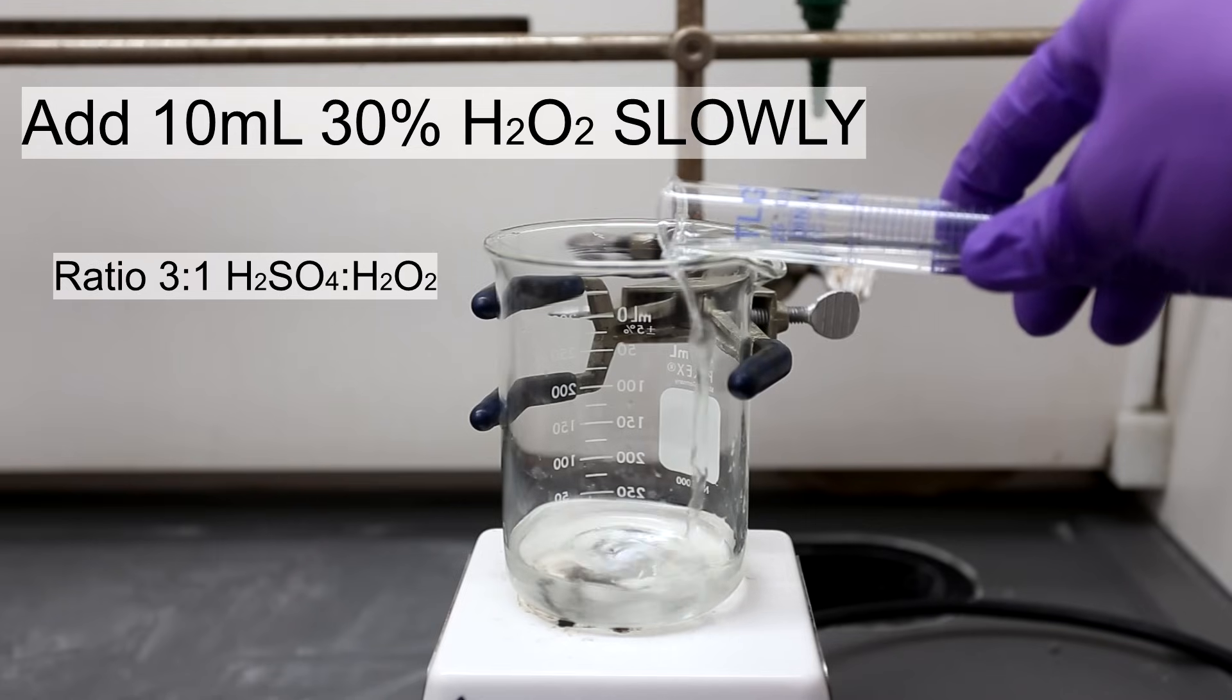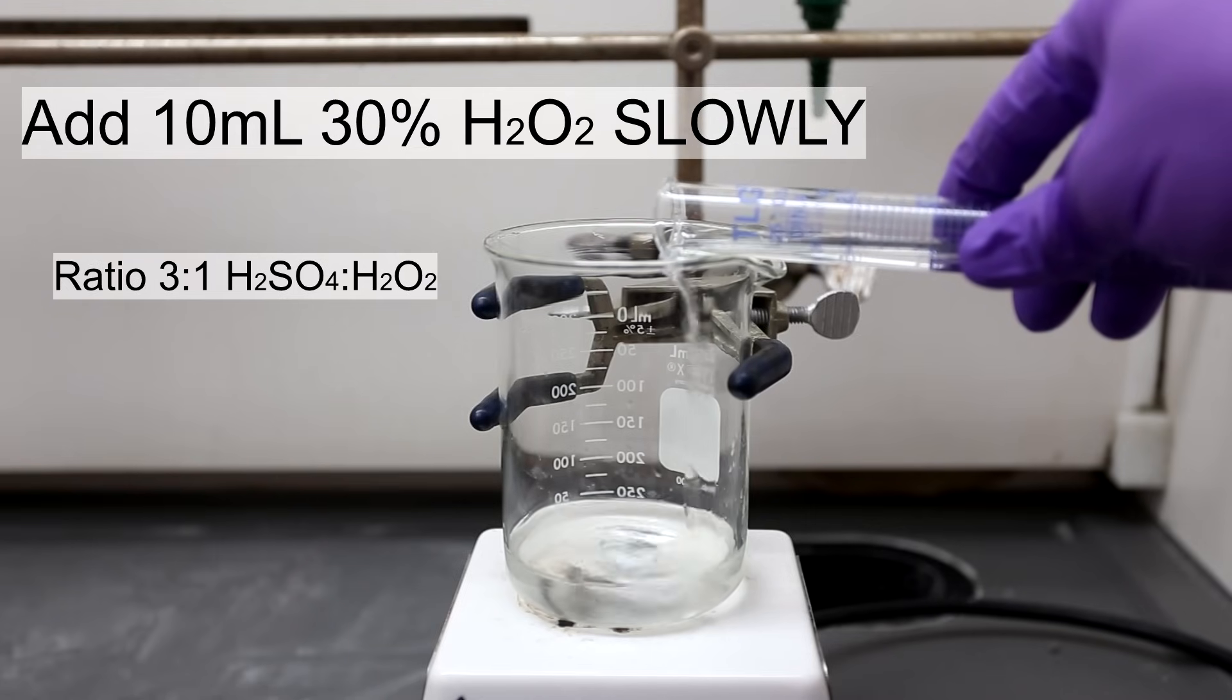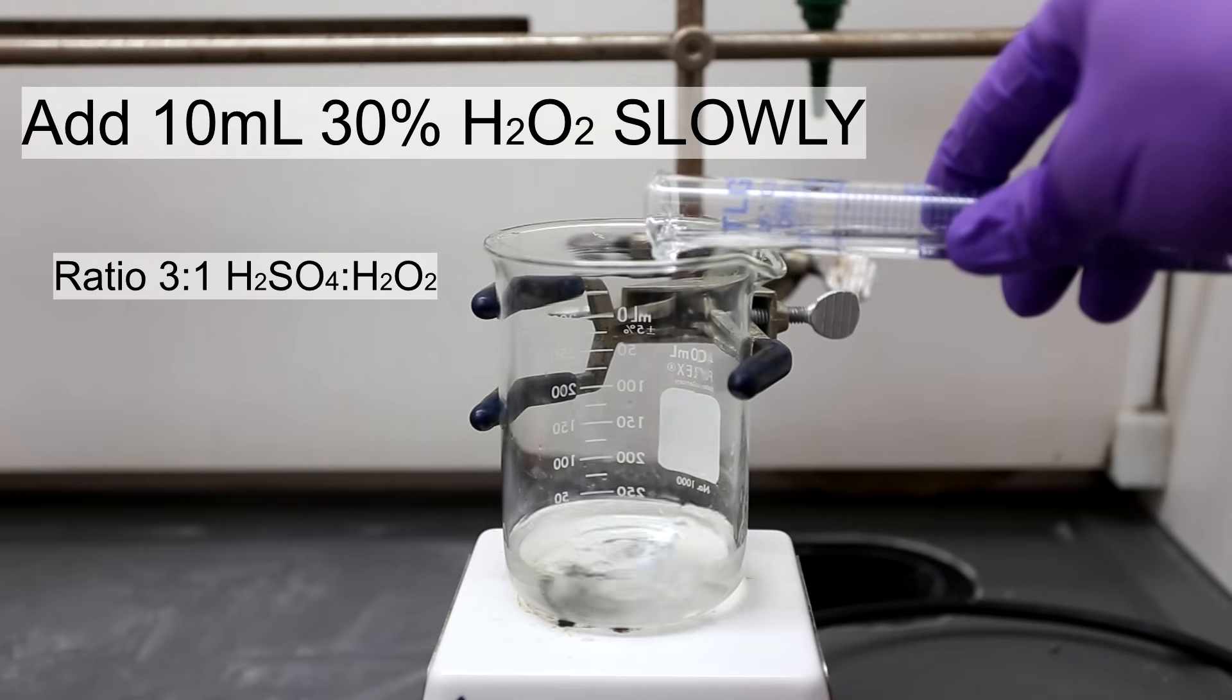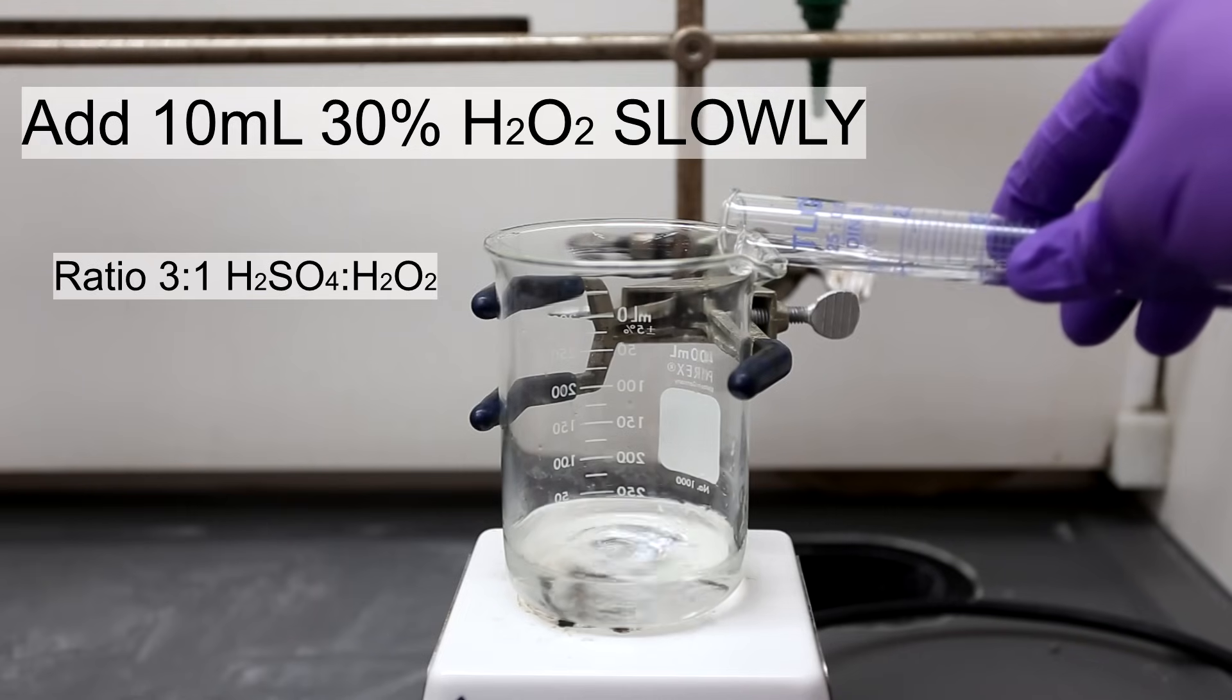Different amounts of sulfuric acid and hydrogen peroxide can be used, but try to maintain a ratio of about 3 to 1 sulfuric acid to hydrogen peroxide.